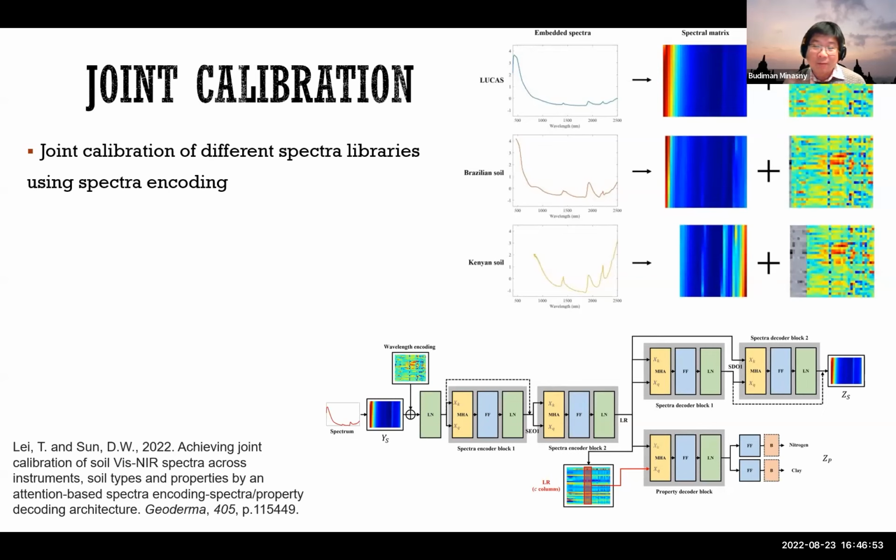So people from this lab and the other lab, if they use different instruments, sometimes the spectra are not compatible. So how do we adjust them? There are ways, of course, that you get the same samples and then you scan on two different instruments, but that requires the transfer of samples. But are there mathematical encoding ways that allow us to do better?